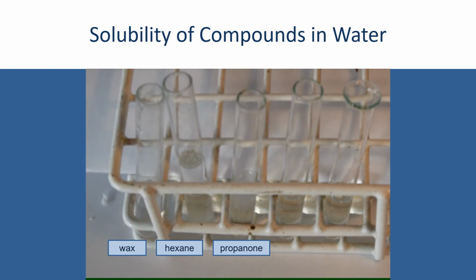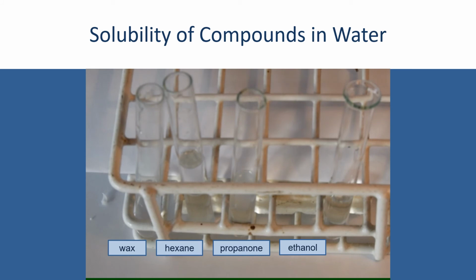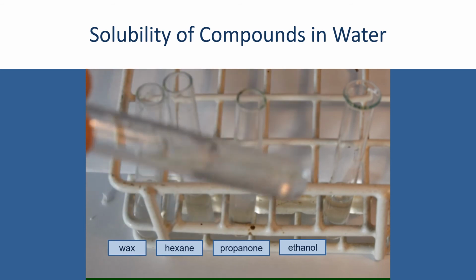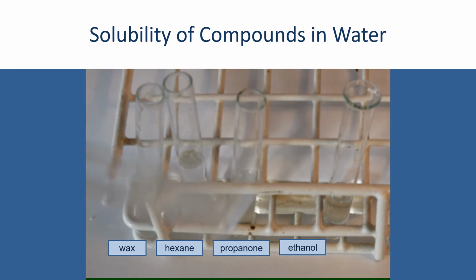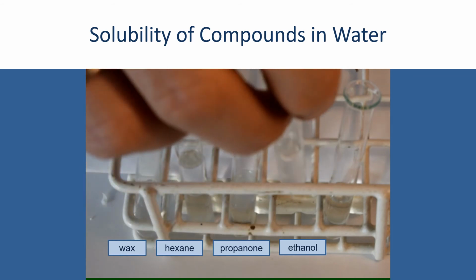Next, I want to look at ethanol. Ethanol contains hydrogen bonding between the molecules. I'll add some ethanol to water, give it a little shake, and you can see there that ethanol, with its hydrogen bonds between the molecules, is soluble in water.